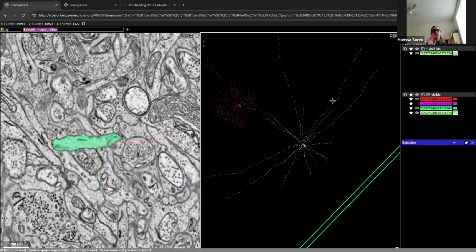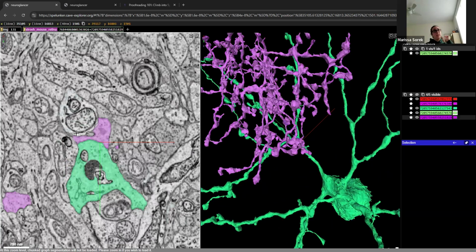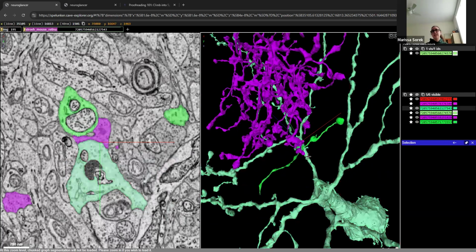So that way, as you're clicking around in the data set, you don't start getting things that are the same color and getting confused. So that's something that is very uncanny with Neuroglancer. It is absolutely great at selecting things and giving you very similar colors right next to each other, like these two greens. And as we saw when we brought in this old segment ID, it decided it was two shades of purple. I don't know why, but the programming does that.